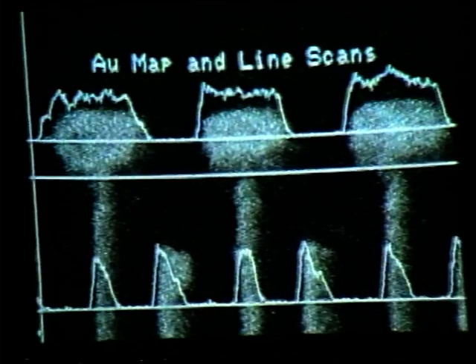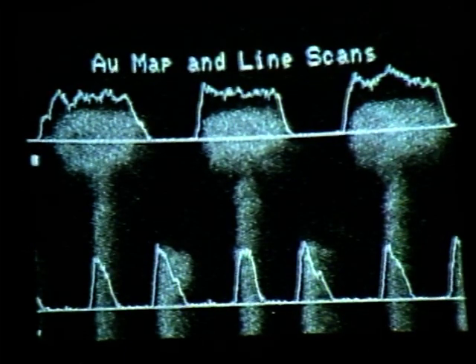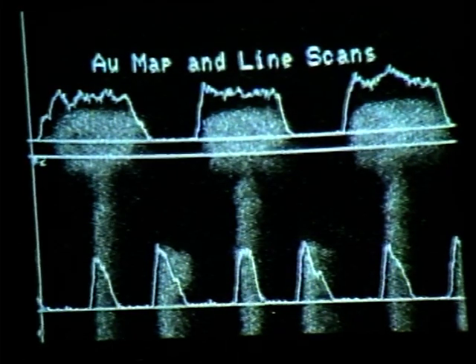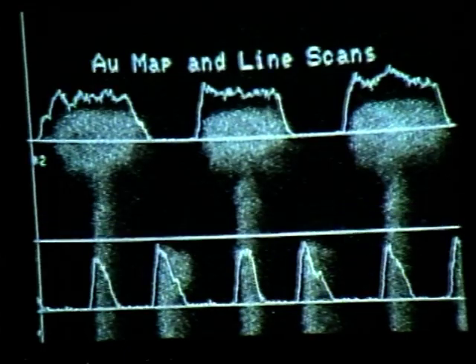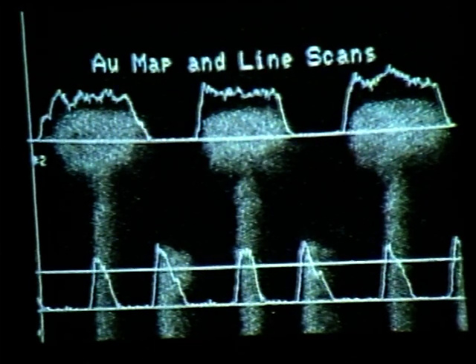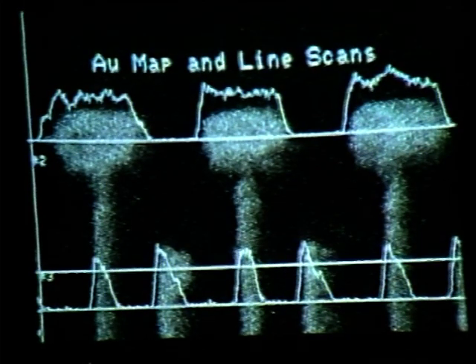So I will go to the far left side of the screen, enter text, number 2, escape to terminate text entry, then move the cursor down to line number 3, enter text, and number 3. Escape to terminate text entry.